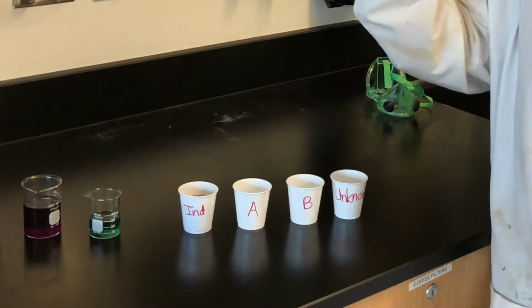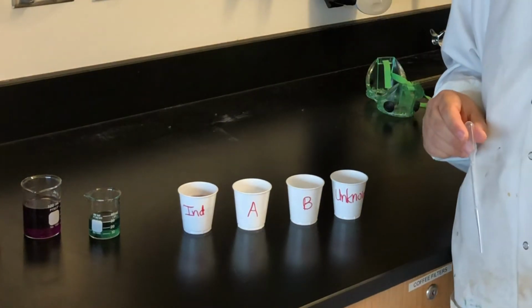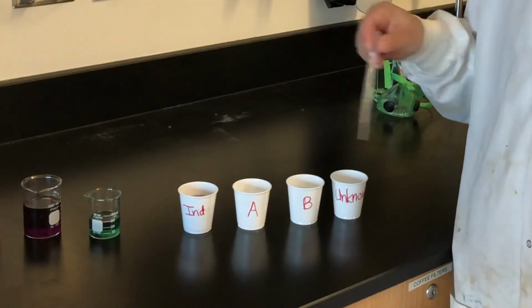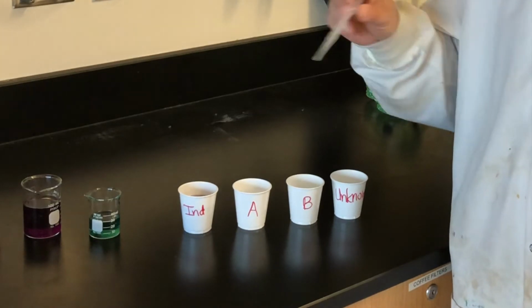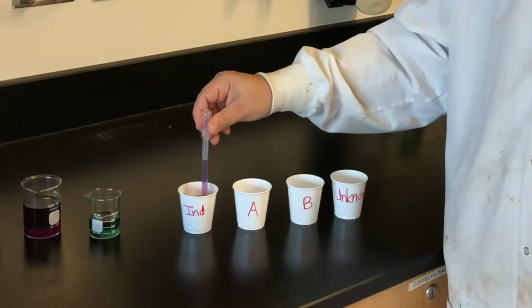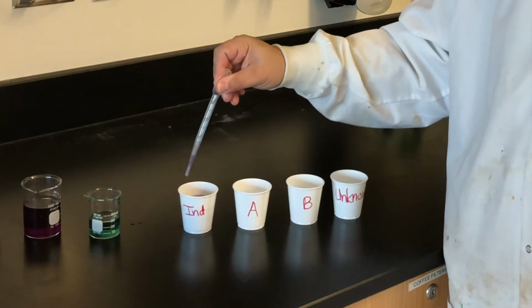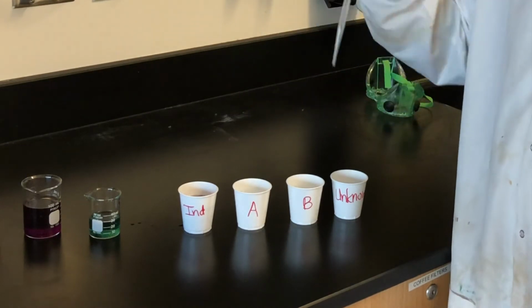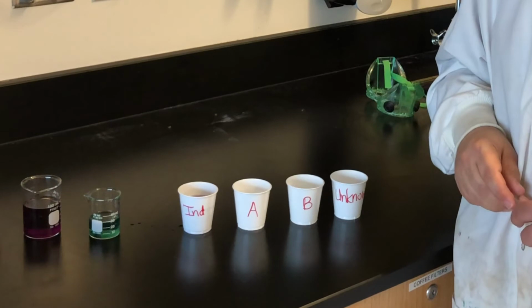Your job is to take the pipette and add indicator to the acid and verify that it's an acid by getting that color that you're expecting. Then add some indicator to the base. Make sure you get the right color in the base. It's really important when you do that you suck up liquid with the pipette, but don't put the tip of the pipette into the liquid, because if the tip of this gets into the acid and then it gets into the base, you're actually putting acid into the base, and that's going to mess up your experiment.